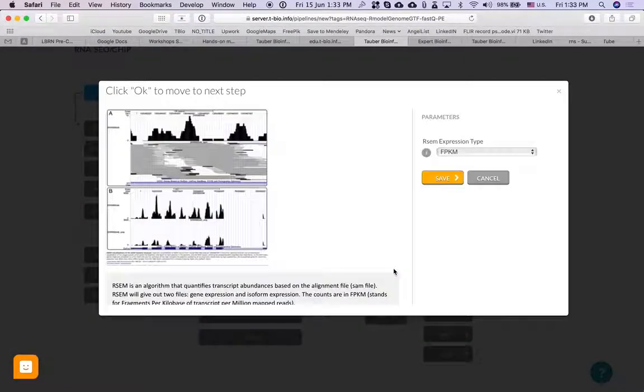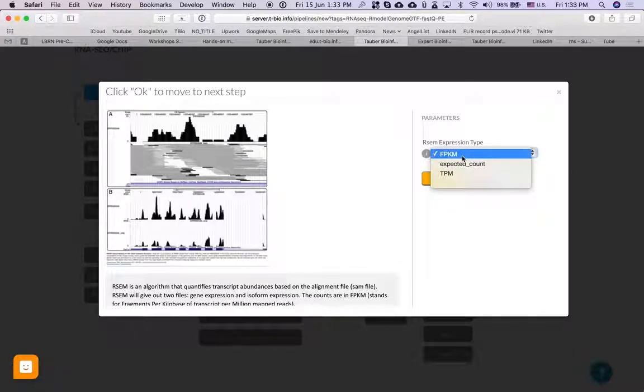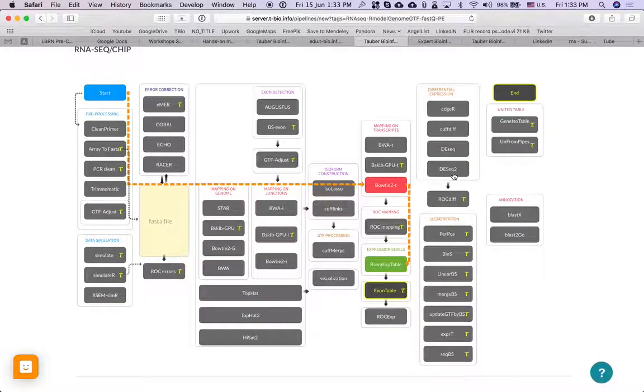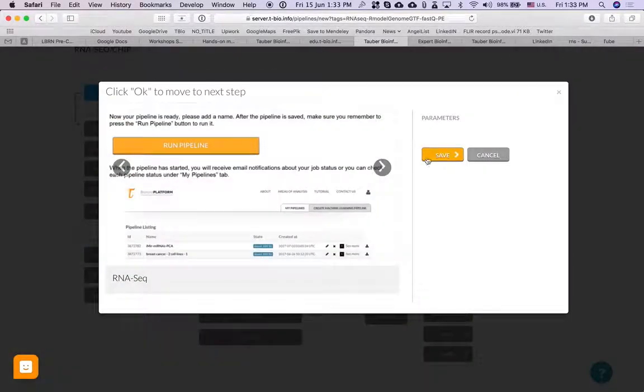Then RSAM expression table. Now here I can check FPGAM or change it to something else. Okay, and then end.